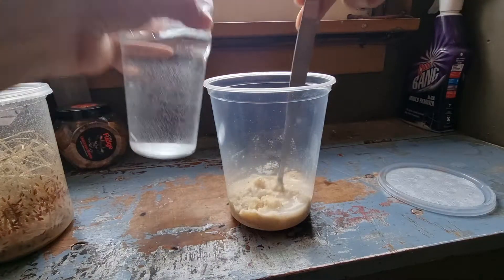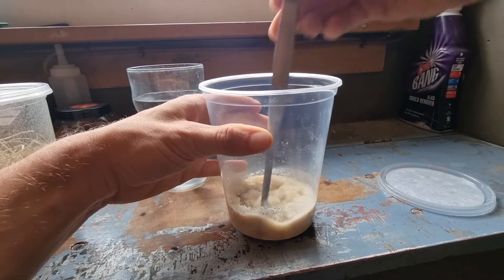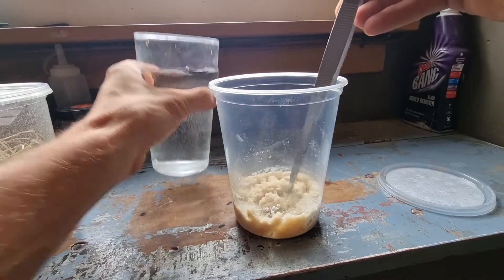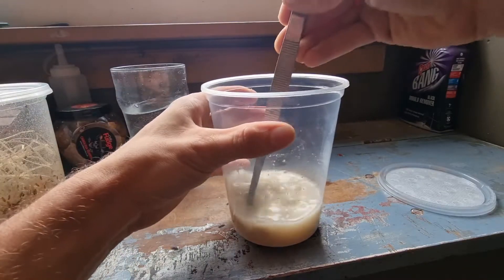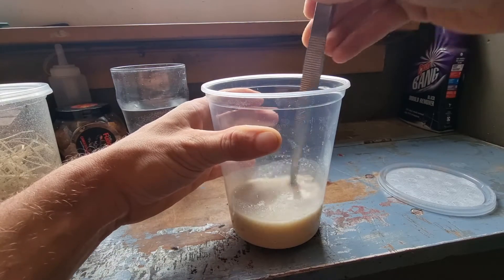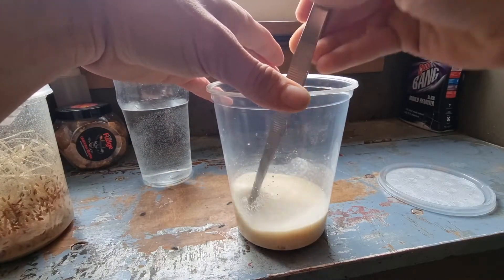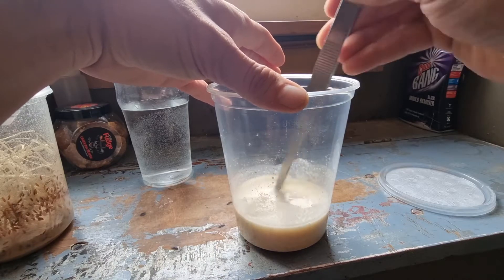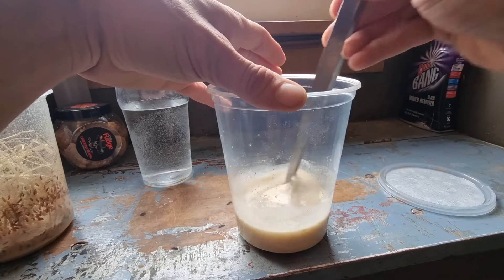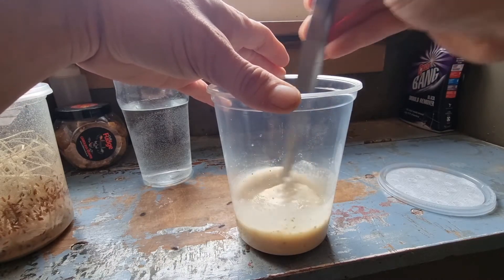Some fine tuning will be needed obviously, because I don't do measurements. You want a paste consistency. Make sure you stir it in really well, getting into the bottom of the cup, and when you think you've stirred it enough, just leave it for about five minutes so all the water gets absorbed.